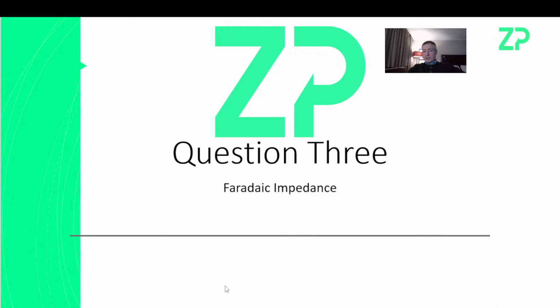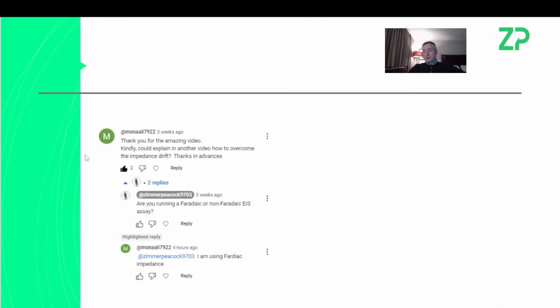I just want to say this is a really hard question for me, that somebody's interested in Faradaic impedance and the drift in Faradaic impedance. The question, why something is drifting, was from a YouTube conversation. Why something is drifting is, something's changing. So is the underlying electrode changing? An electrode could be corroding, that would give you drift. Do you have polymers or layers on top of the electrode? Those layers are probably soft materials, so they could definitely change. So that would give you a drift.